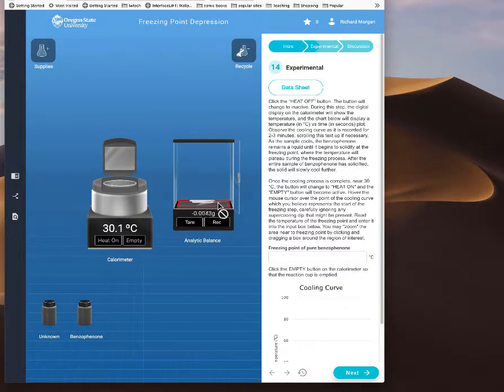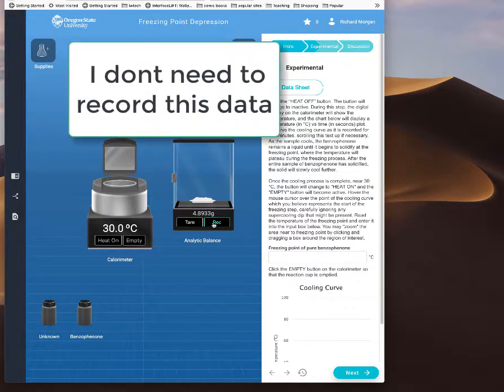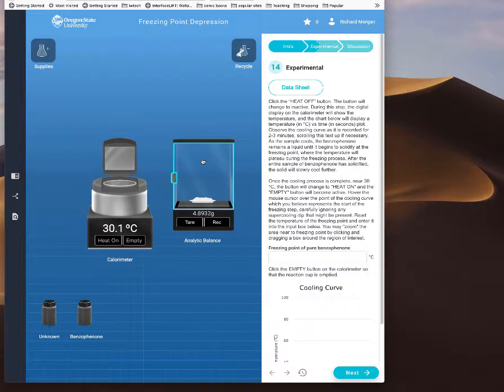Going to put this right here, and then I'm going to put 1, 2, 3, 4, 5, and then throw this out, close the door, and record that number. It's not recording, never mind, it doesn't matter for this. This is the first part.